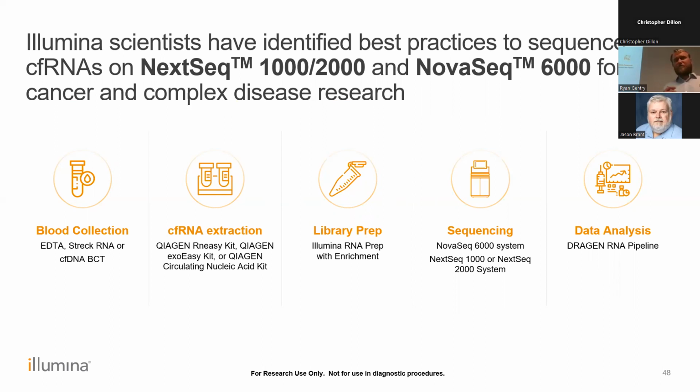Now, again, your local core has excellent sequencers. They have a NovaSeq 6000, which is one of the most cost-effective sequencers out there, and it takes a lot of sequencing to do this. So Illumina has a cfDNA assay out there that does about 500 genes, and it takes the equivalent of a 30x whole genome, so 120 gigabases of data to be able to sequence that, because you need a lot of data to get down to those 0.5% to see these mutations that are happening. And the same thing happens with the RNA, where you have to do deep sequencing to be able to identify those different transcripts and the mutations that are happening on those transcripts.